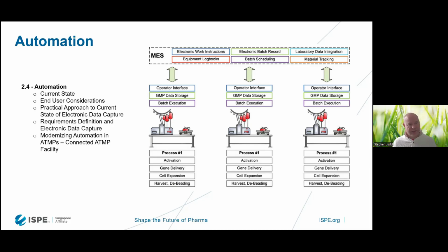Once the apheresis is drawn, from that point the material has to be very critically tracked to ensure that it is monitored the whole way through the logistics of transferring to a production facility, moving through production, and then moving back to infusion into the patient, to ensure that every step of that operation is known, recorded, auditable, and that what goes back to the patient is their material and not somebody else's.